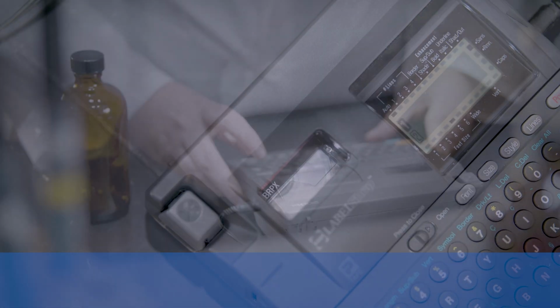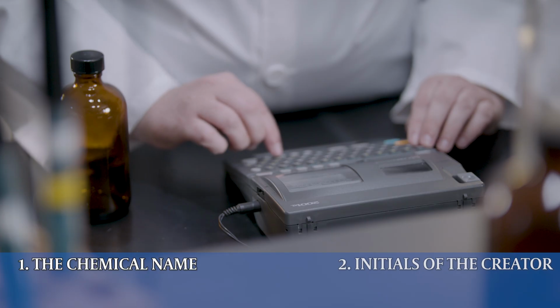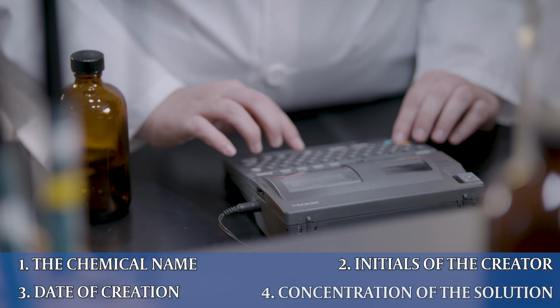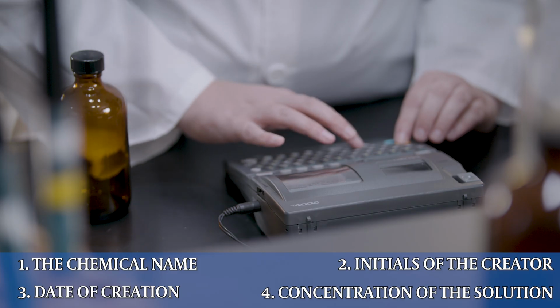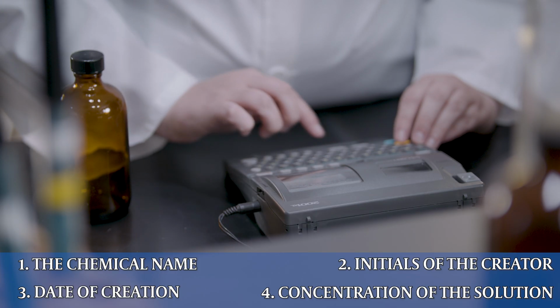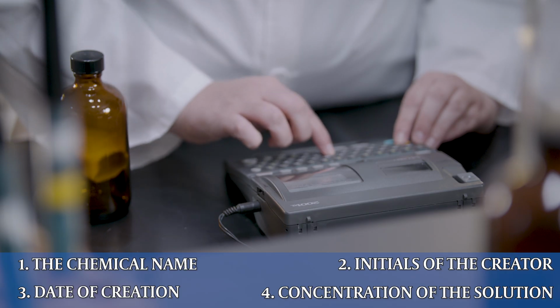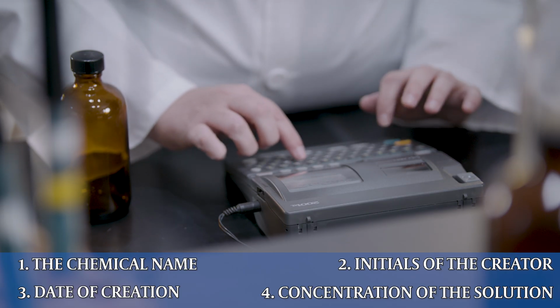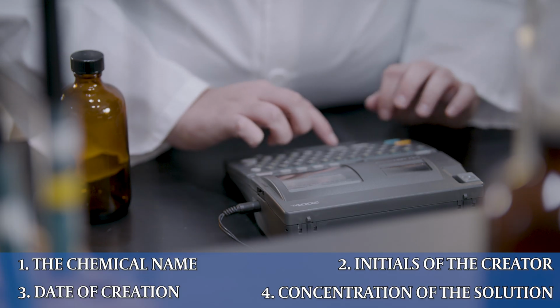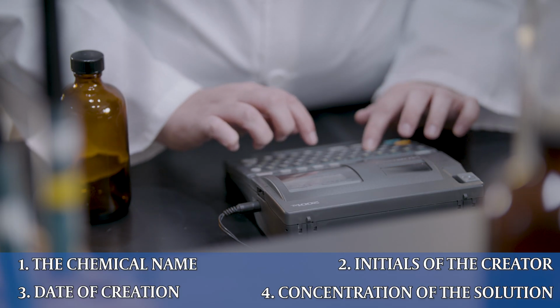This information includes the chemical name, the initials of the creator, the date of creation, and the concentration of the solution. These details let us know exactly what's inside the container, who made it, how old the substance is, and how potent it is. Whenever possible, use a label maker as opposed to a handwritten label.